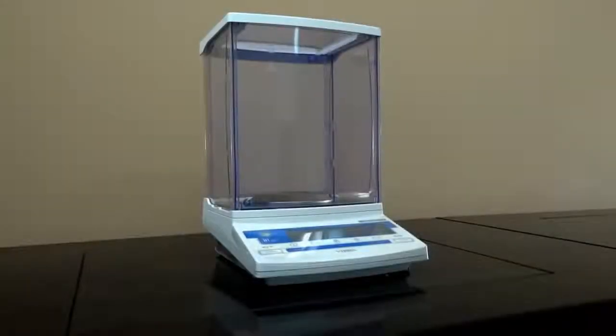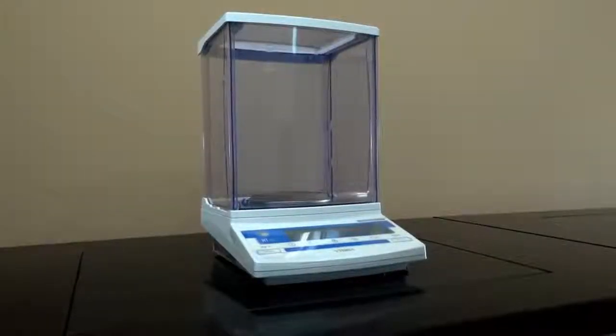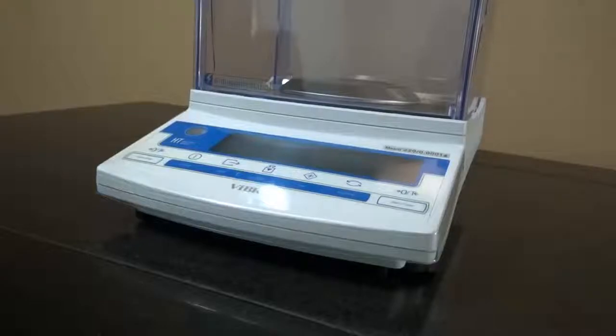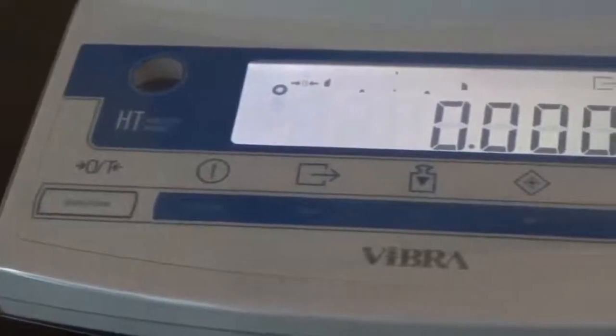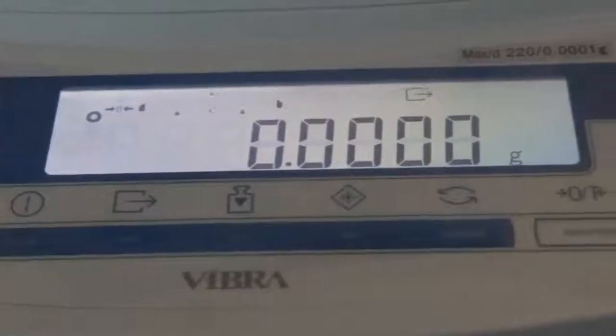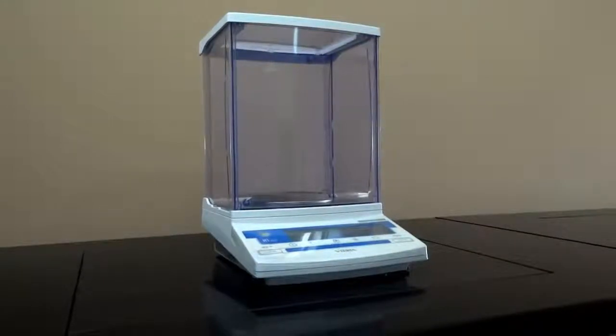The HT224 and the HT224R are analytical balances equipped with the high-performing tuning fork sensor. The HT is designed and manufactured in Japan to provide the sophisticated lab user many advantages and flexibility.